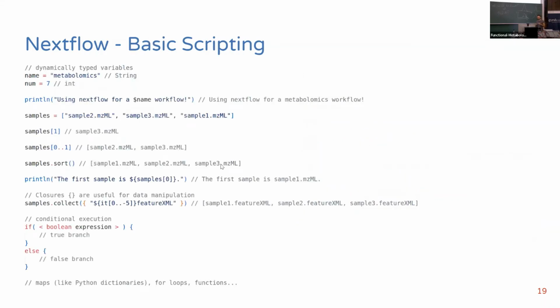This is just an overview. If you like, you can look into it. It should just demonstrate that you can use it like any scripting language. It's very easy to use. It has dynamically typed variables that you can access in a bash-like manner with the $ sign and use in a string, let's say, and you have lists that you can splice and index. You have methods. And one important thing is the closures here.